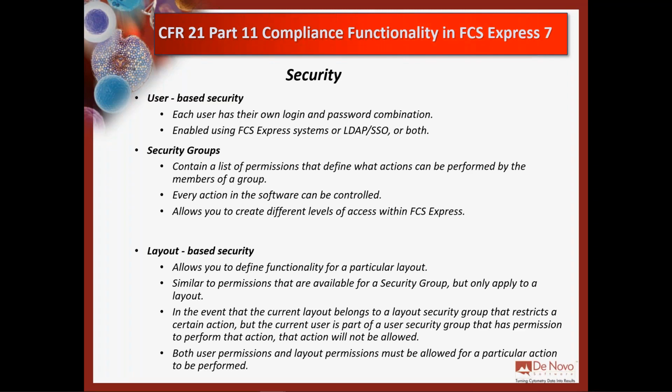And security is handled in FCS Express through security groups, which are essentially groups of people that have permissions to do one thing or another in the software. And really every action in the software can be controlled. So you can say that a technician is allowed to move a gate but not delete a plot. A technician is allowed to export a report but not delete a page from an analysis. So this really gives you flexibility to create different levels of access.